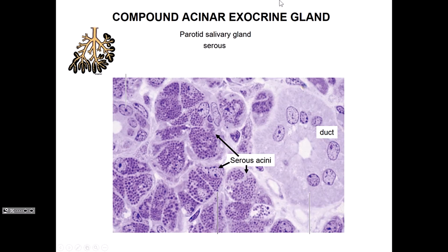And if we look at the contents of the cells that are secreting, they stain rather darkly, so that's a serous secretory cell, not so much a mucus cell, because mucus is light colored and goopy. Serous is much more darker stained, so that's a serous gland. Okay, and again, it's a merocrine mode of secretion.